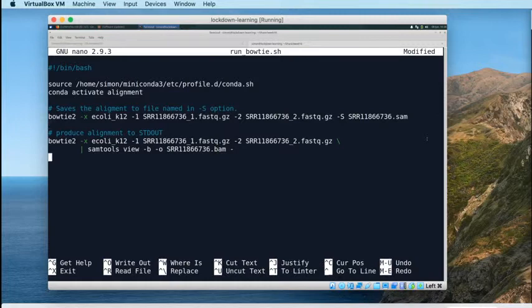And then the final question, just to tackle that one as well: if the Bowtie command isn't in your history, it will probably be because you will have shut down your virtual machine without exiting your terminal.